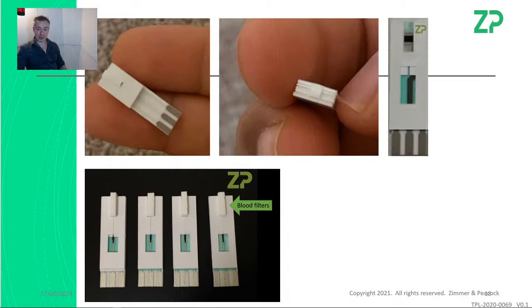So we have a capillary fill, and the capillary fill electrode is like a traditional glucose sensor. It will suck the sample into it. So it's really good for moving sample onto sensor. It's really good for controlling the volume. Now the version that they have is the filter version. So I'm hoping that they intended to order it with the filters, because they have.